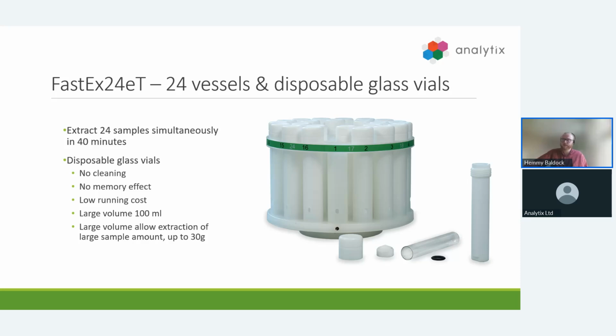Another point I wanted to quickly touch upon when talking about the system and the rotor specifically is the use of disposable glass vials. Disposable glass vials prevent the requirement to clean between runs, and the memory effect often observed when using polymer vessels or other technologies is eliminated completely. This is a valuable feature for trace analysis of challenging species such as dioxins.